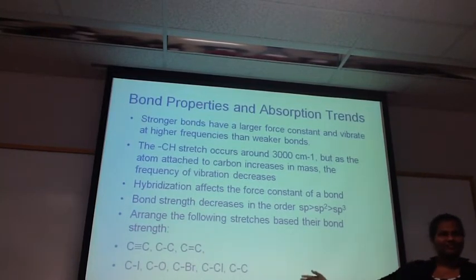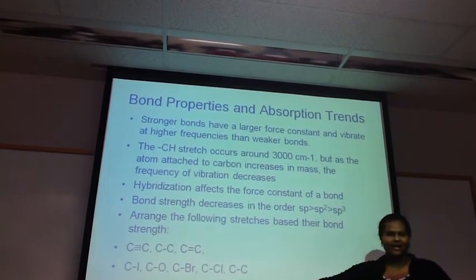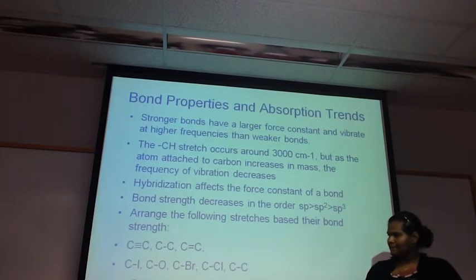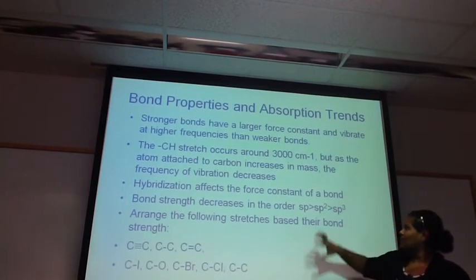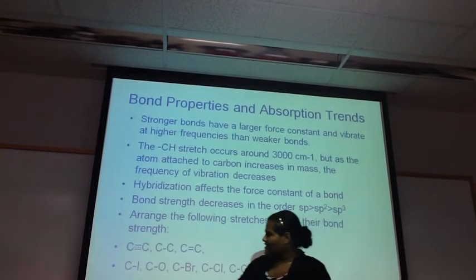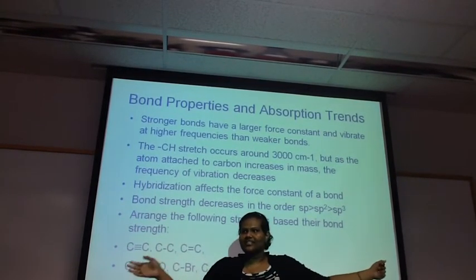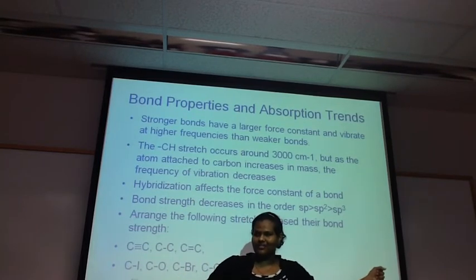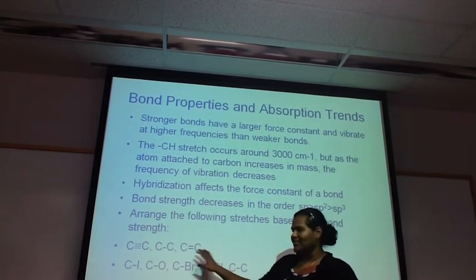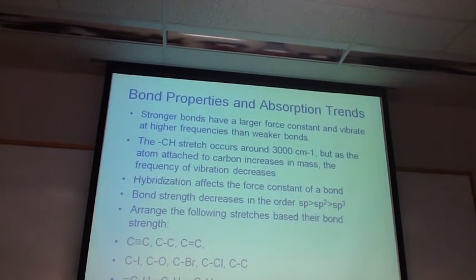For the last one, we didn't really talk about this, but I want you to guess. It's still going to follow this order: triple bond, double bond, single bond. But you have this hydrogen next to a triple bond. Think of your triple bond already being locked in, so this one is not as flexible. That's why this will also be the highest frequency, then lower, and then lowest. Triple, double, single.